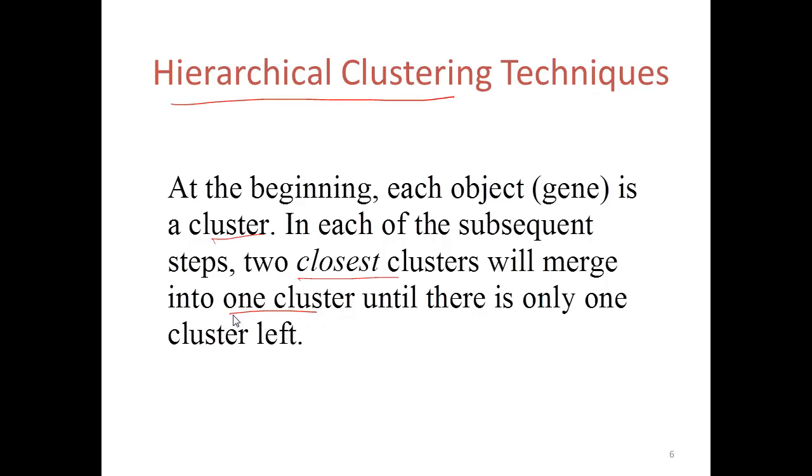And the values associated with one cluster, again, you can make lots of variations here, but let's just say it's the average of the 2 clusters which comprise it. And we'll repeat this step 99 times so that we'll only have 1 cluster left at the end. Once you cluster the genes, you could do exactly the same thing on the other axis in the columns with the experiments.